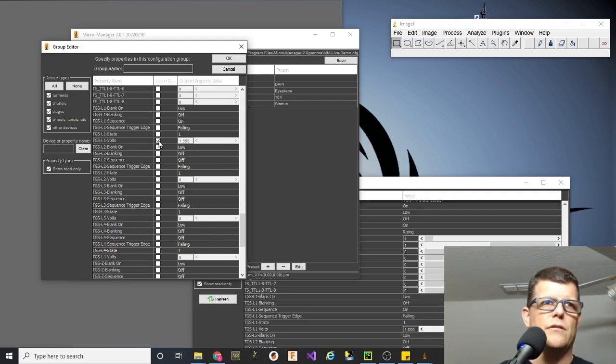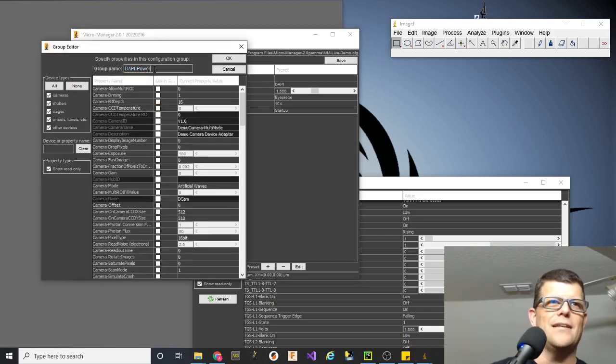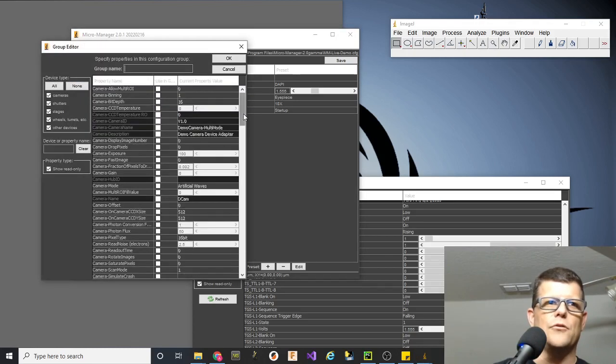We'll go to voltage. We'll check it on, and I'll call this DAPI power. Now, I did something kind of not super smart here, which is this is alphabetized in the group, and I'm using names instead of numbers. So now they're all going to be scattered around based on their alphabetization. So maybe we'll edit this and say L1 power. All right, and then as we add these, we'll just call them L2 through 4.